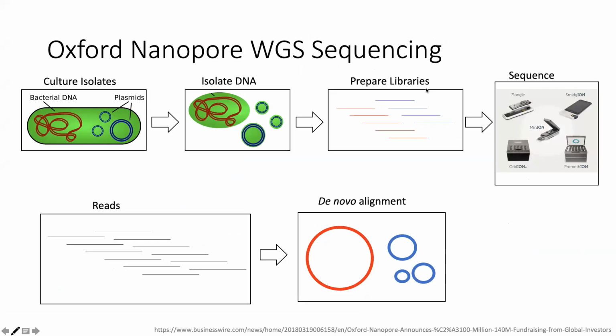Okay, so this is how nanopore sequencing works. PacBio sequencing is also long read, and I don't have a slide for that, but it has some similarities with Illumina MiSeq sequencing and some differences. So I'm not talking about metagenomics right now. We're still talking about cultured isolates.